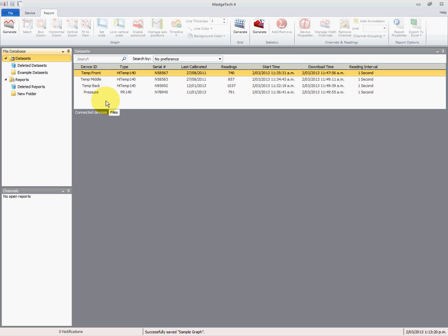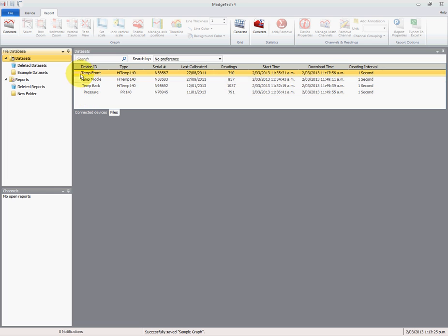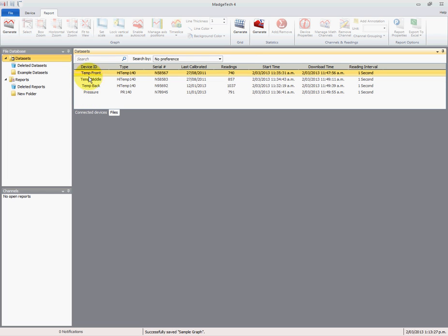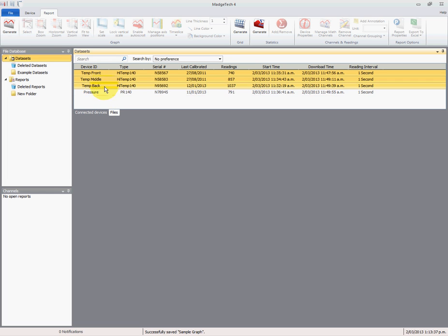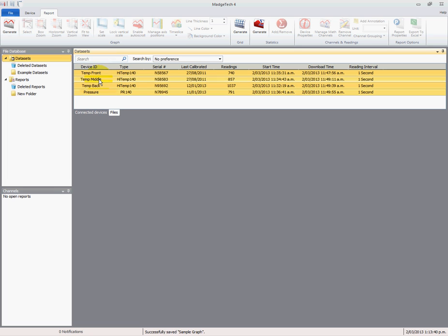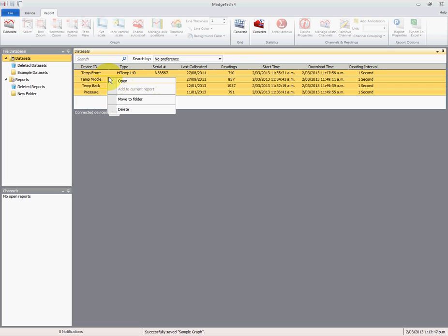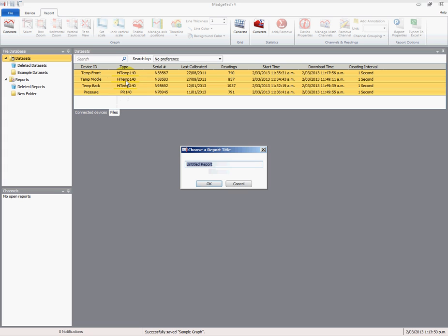So we need to only select the ones that are applicable to us. In this instance it's all of them, so we can select the first one, hold the shift key down, and select the final one and all of them will be selected. If we only wanted to select some of them, we can hold the control key down and select individually or deselect the ones that we want. In this case I want all four. They're now all highlighted yellow. We'll right click and select open.